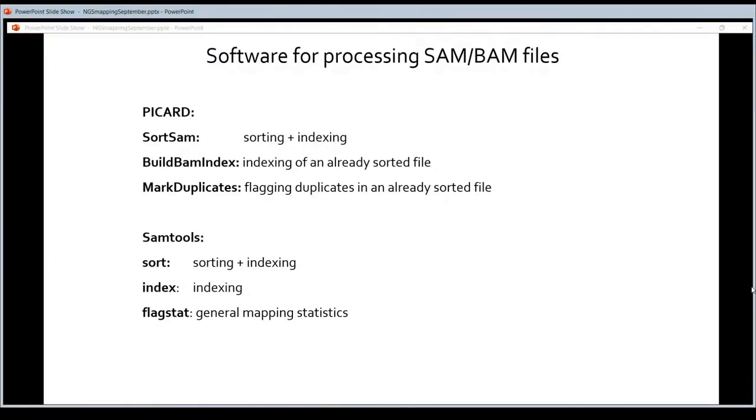So in RNA-seq data, you will have many biological duplicates, but of course there also will be technical duplicates. There's not really a way to avoid that. But because you cannot make the distinction, people say, oh, we're going to play it safe and we're not going to remove them. We're going to assume that they're all biological. That's the best thing that you can do here. Now for DNA-seq reads, you don't expect to see duplicates. So there people do remove them because you don't expect to see biological duplicates. So when you see duplicates, they're probably technical duplicates.